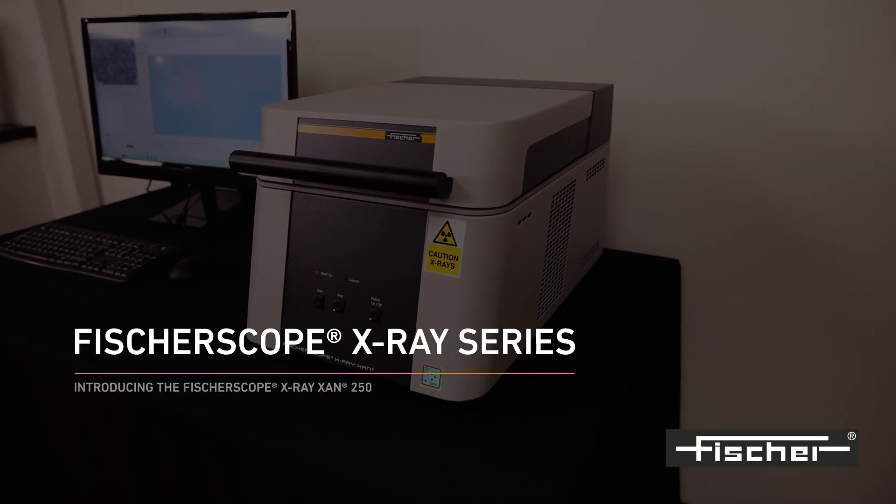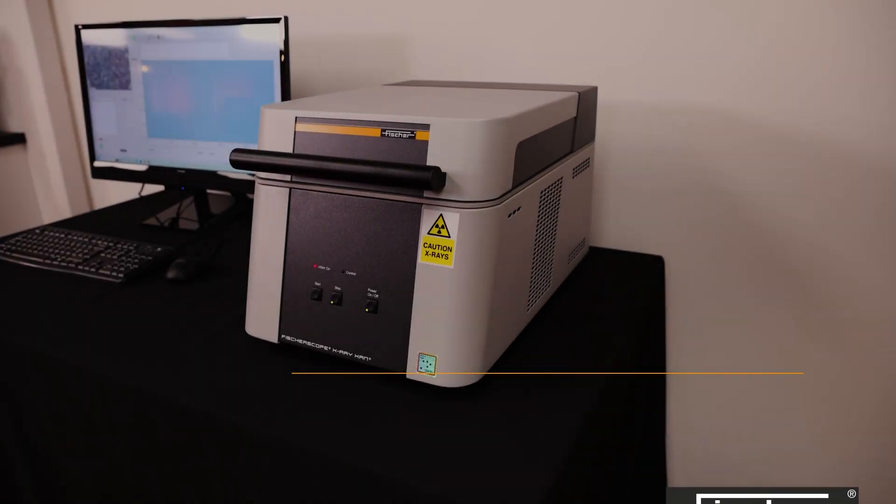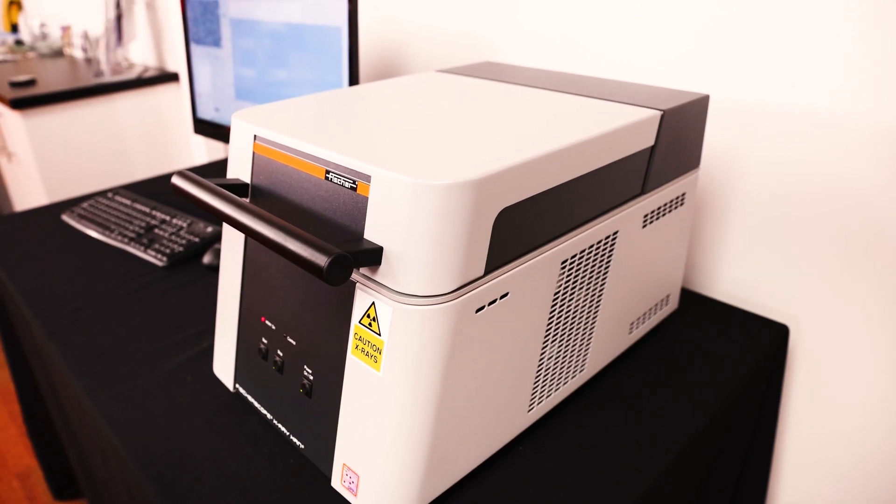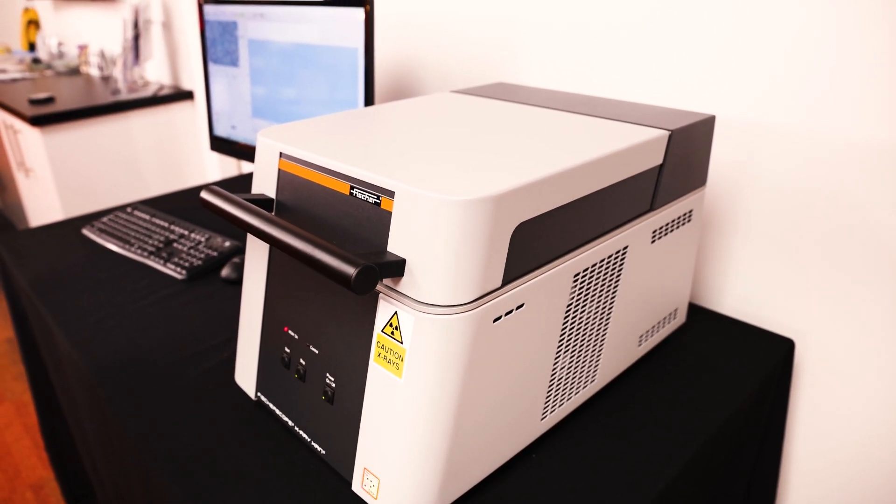Introducing the FischerScope X-Ray XAN 250. The FischerScope X-Ray XAN 250 is a compact, high-performance measuring instrument with a universal application.